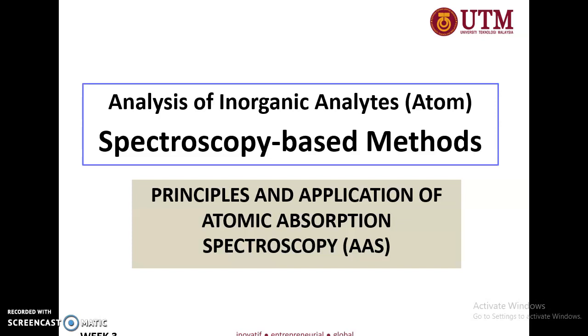So now we are in the third chapter of the instrumental analysis subject, and this time we are going to learn the third principle of spectroscopy, i.e. atomic absorption spectroscopy. The abbreviation is AAS.